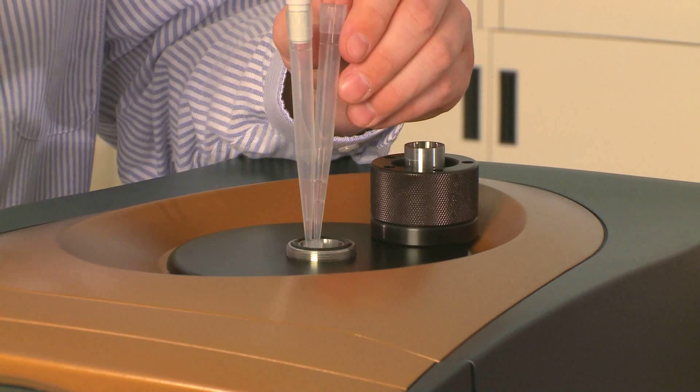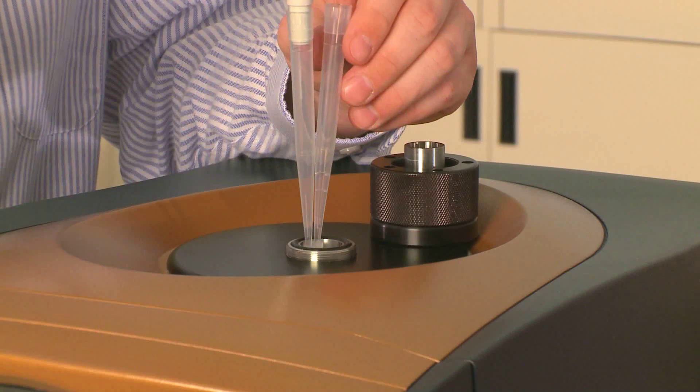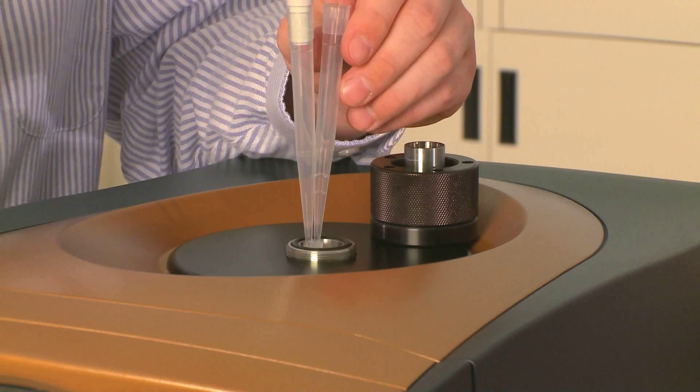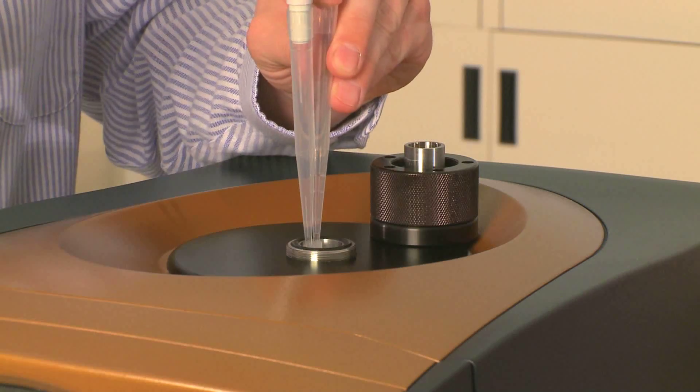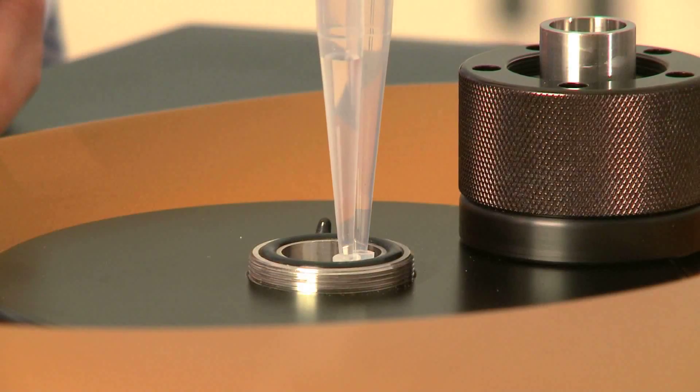I'm going to slowly inject the solution — here it's water — into the DSC cell, and slowly rock back and forth to make sure there are no bubbles. Once I see liquid on both sides of the tips, I cap one side and slowly lift up. Now you've filled the reference side.